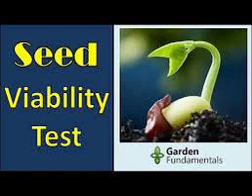Similarly, these seedlings are kept in a hot air oven at 100 degrees Celsius for 24 hours to find out the dry weight of the seedlings. Seed vigor index is calculated by multiplying germination percentage and seedling length or dry weight as follows. SVI length equals germination percentage multiplied by seedling length in centimeters. SVI mass equals germination percentage multiplied by seedling dry weight in milligrams. The seed lot showing the higher seed vigor index is considered to be more vigorous.